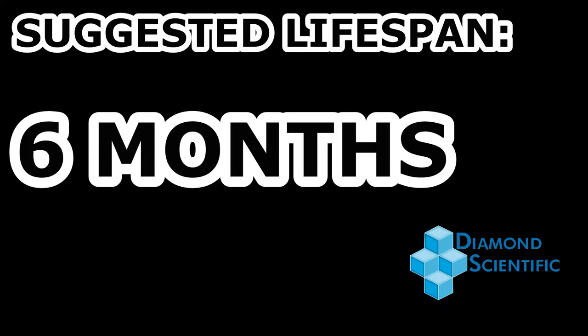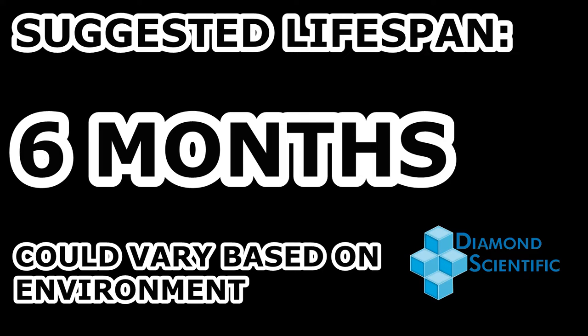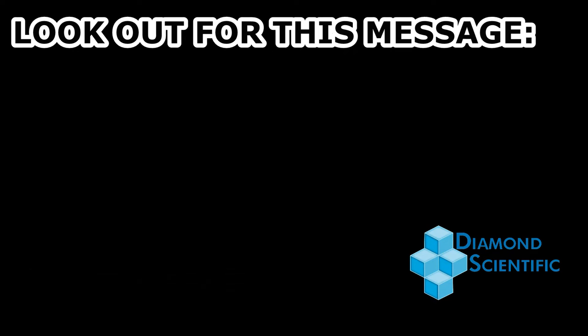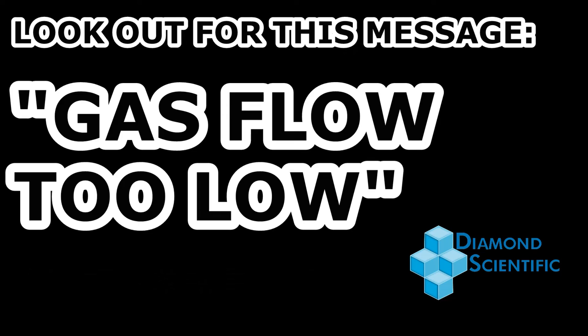The PTFE filters have a suggested lifespan of about six months, but that could vary a little depending on how dusty or dirty the environment is. Also, if you see a message on your SWG 100 display saying gas flow too low, that could also be an indicator the filters need to be switched.